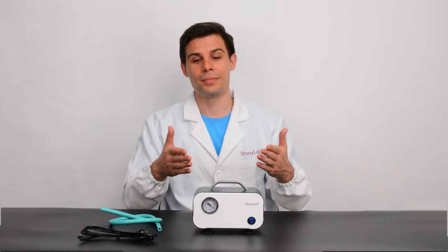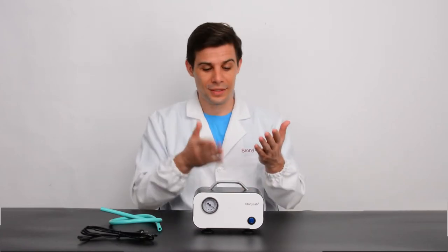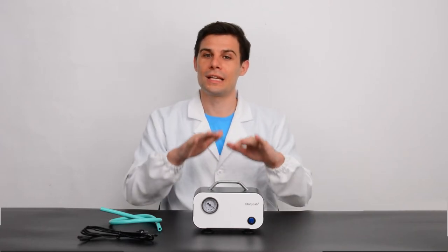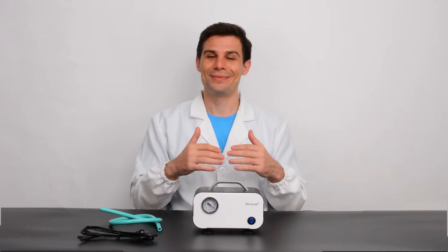If you compare a traditional oil pump with our pump, you will notice that this pump is oil-free, pollution-free and it produces just a little noise. There is no need to change or monitor oil. That's it. Simple.